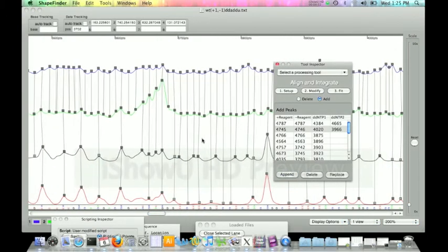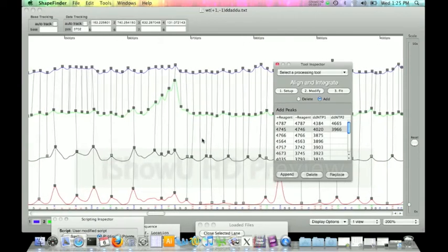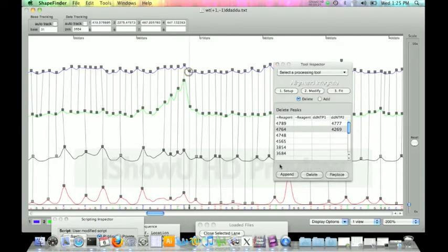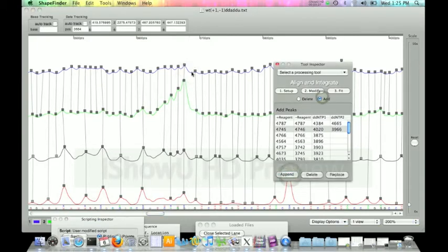All right, now we're getting a little bit into a gray area. This is going to be a little tough because both our ladders are getting some signals from this area, so you really have to play with it and find the best set of peaks where you're minimizing the number of peaks you have to put in, but still getting it to line up with the sequence correctly. So I see some spacing. What I'd really like to do here is make this A and this sequence underneath this peak right here. That's just because I've done this experiment a few times, but I know that peak needs to be there to help it line up. So I'm going to go ahead and drop in 2 peaks in here, replacing the 1.